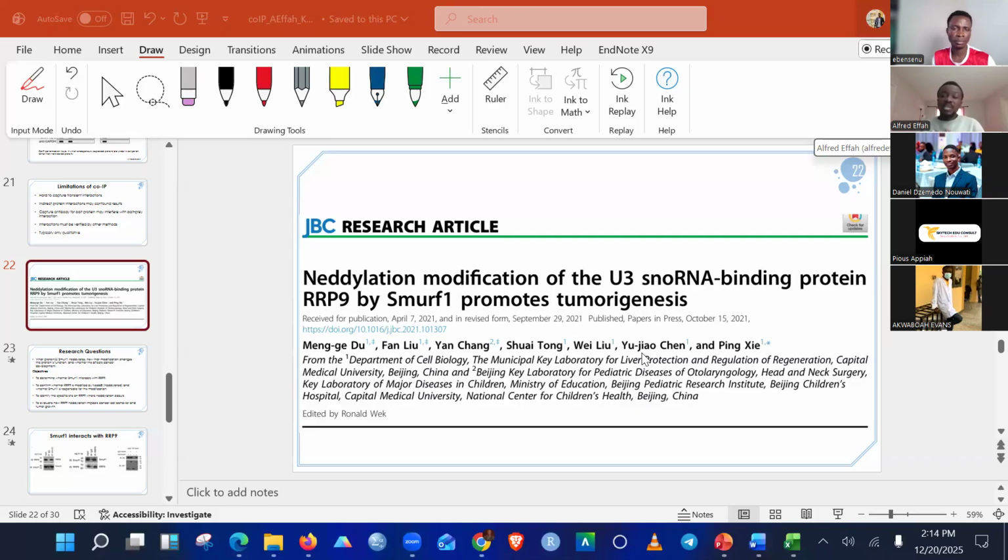If you don't want to do it that way, we can also do immunofluorescence, whereby you take the cells, let's say you culture your proteins together with the cells. When the cells are growing, you stain and then visualize to see whether they are co-localizing. Sometimes you could see that these two proteins always end up in the nucleus and are overlapping, or always together, whilst other proteins are somewhere else. So that's one way we can do it.